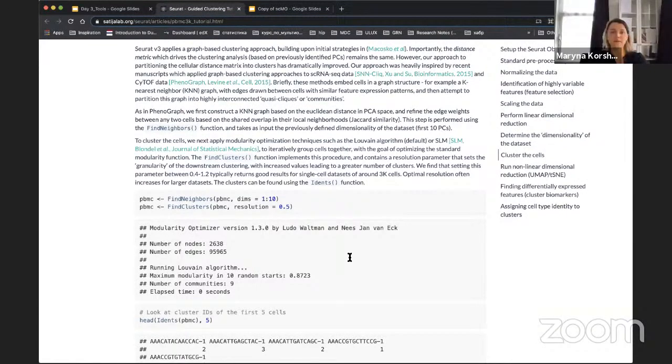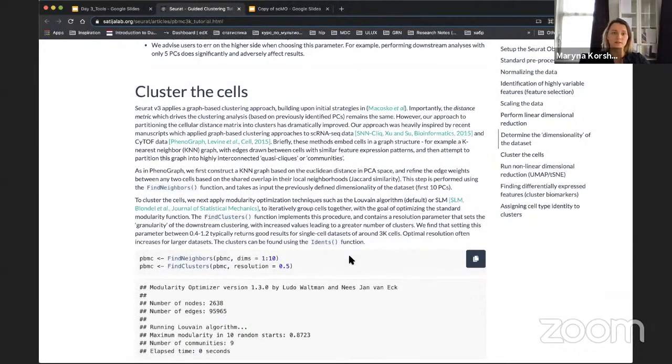Yeah, imagine that first of all, you are limited by computational power, and it's difficult to handle all of this data set afterwards. So you can actually operate with data. Secondly, just a particular number of genes in this huge list varies. So just some set of these genes may tell you something, because you find different transcripts, but quite often they do not have any changes, any impact, and the information of them might not be so relevant in your experiment. That is why you do dimensionality reduction as well.